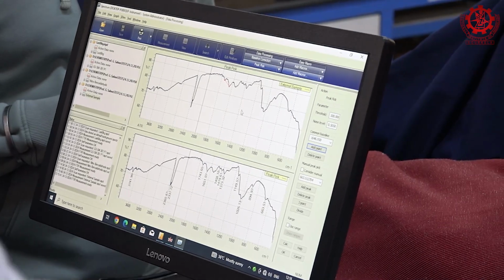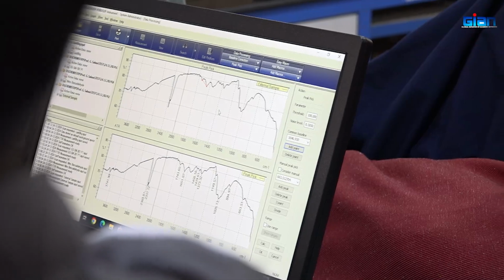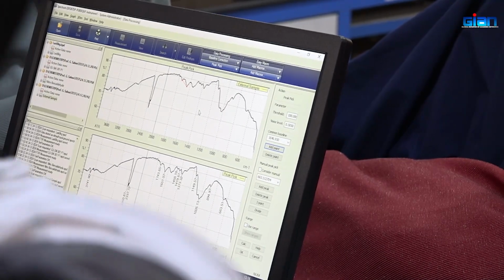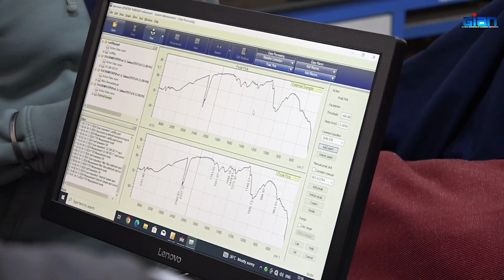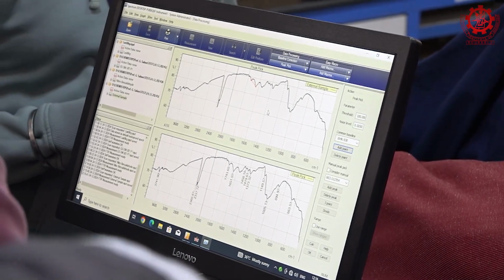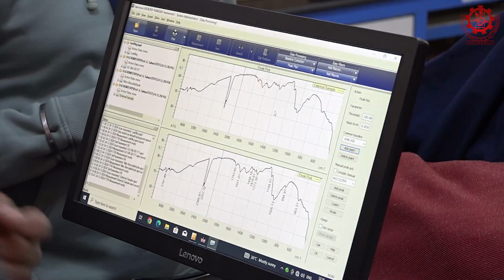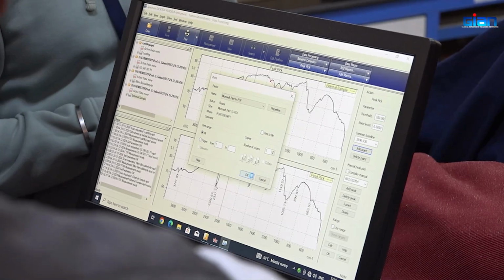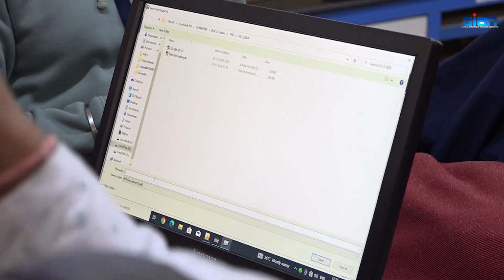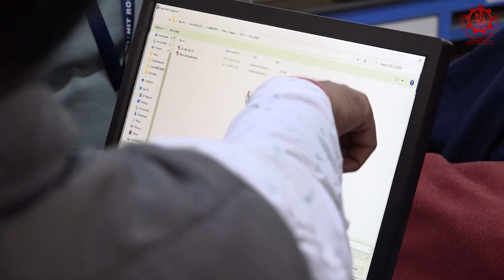Okay. So think that, let's say, in this region you have 3 peaks, so they will come out sharp. In this region there are 300 peaks. What will happen? They will merge, and that is exactly what is happening with this molecule. It is such a huge molecule that you don't get individual peaks, but you get peaks merging on each other. And it is very, very difficult to characterize.